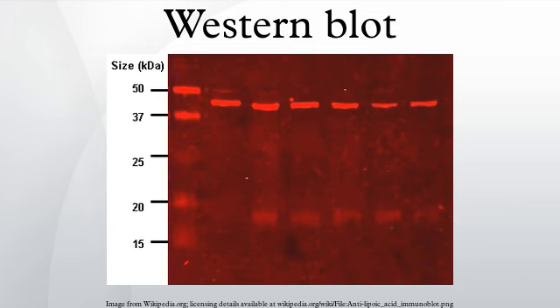The concentration of acrylamide determines the resolution of the gel. The greater the acrylamide concentration, the better the resolution of lower molecular weight proteins. The lower the acrylamide concentration, the better the resolution of higher molecular weight proteins. Proteins travel only in one dimension along the gel for most blots. Samples are loaded into wells in the gel.